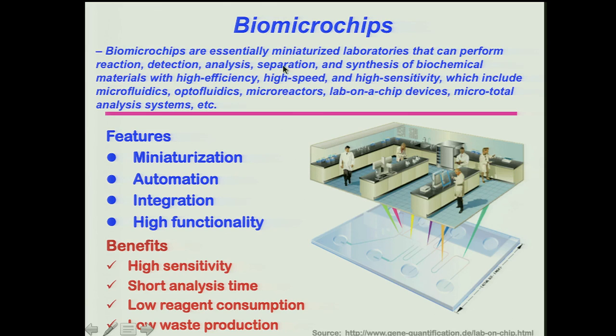The biomicrochips are essentially miniaturized laboratories in a single chip that can perform the reaction, detection, analysis, separation, and synthesis of biochemical materials with the benefits of high sensitivity, short analysis time, low reagent consumption, and low waste production. And biomicrochips include microfluidics, optofluidics, microreactors, lab-on-chip devices, micro total analysis systems, and so on.